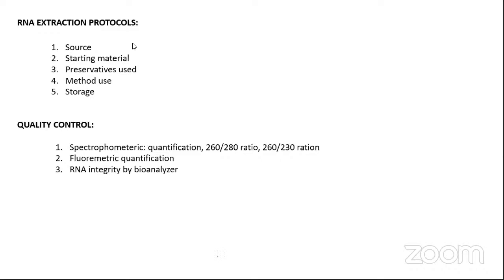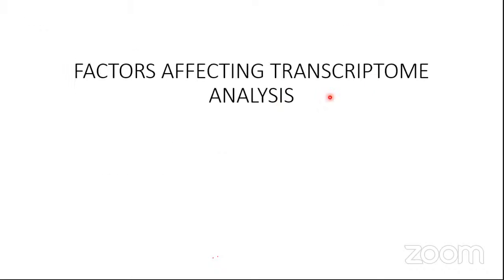So now let us see what are the different factors which affect the transcriptome analysis. So as for the experiment also, for isolation of RNA there are multiple factors, for analysis also there are multiple factors. Before we go into that, we have to see all these factors.